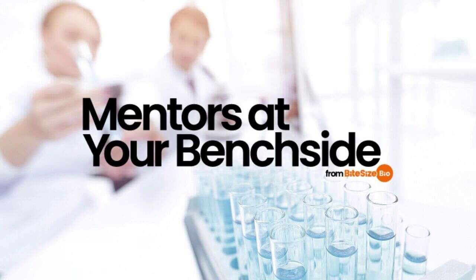Pharmaceutical production line areas are generally kept clean and under highly controlled conditions. Humidity levels are generally below 20% with 24-hour air conditioning. This creates a dry environment, and any movement of objects can cause friction. This friction creates static electricity, leading to considerable errors and discrepancies in weighing measurements, ranging up to dozens of milligrams. With that in mind, here are 3 tips to avoid drift in analytical balances.